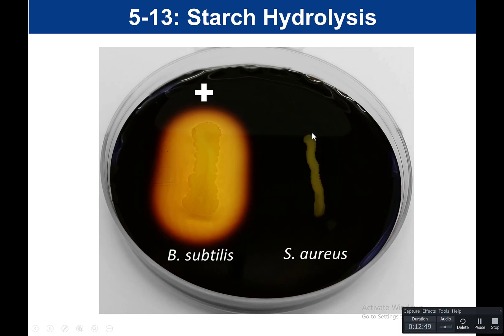For Staph aureus, we can see growth — the bacteria did grow — but they did not utilize starch as a food source because the starch is still present and it's black around there. Since Staph aureus did not use starch, it used peptones — proteins — instead as a food source. So it does grow, but it did not hydrolyze the starch; the starch is still intact and present, so the iodine reacts with it and turns black. Staph aureus is our negative for starch hydrolysis.